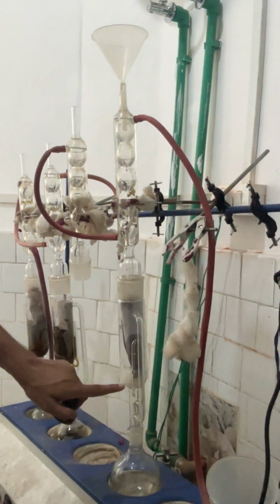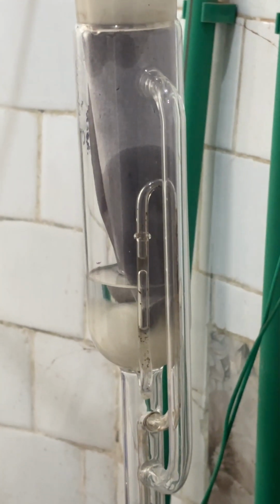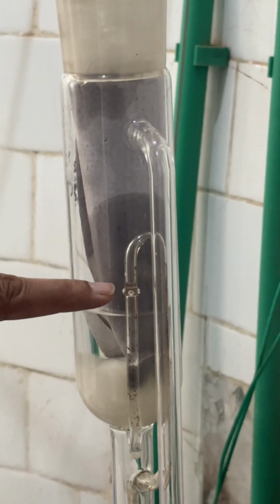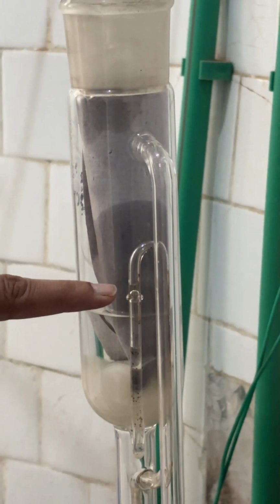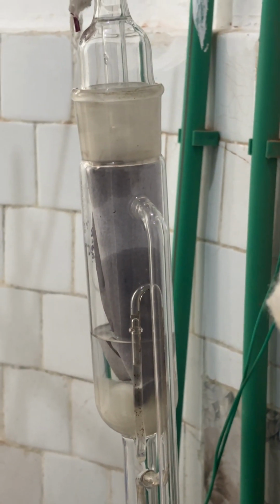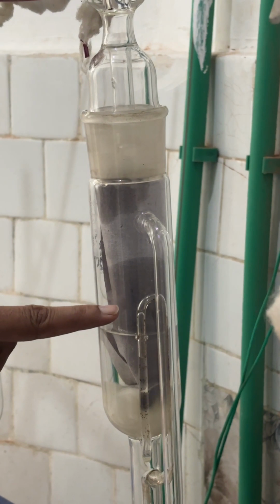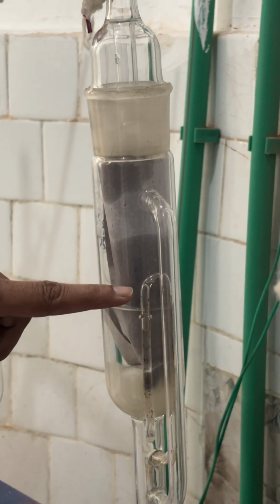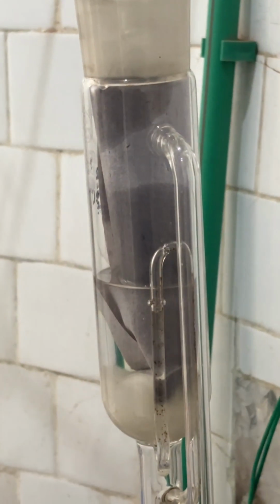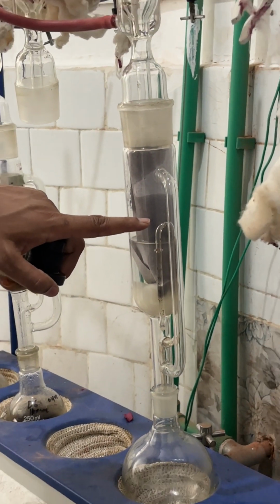So you see now it's rising. Show close up of this. So it's rising. Okay. So we'll add again and see it's rising. Once it reaches this point, it will siphon out into the flask. So we'll wait for a bit.